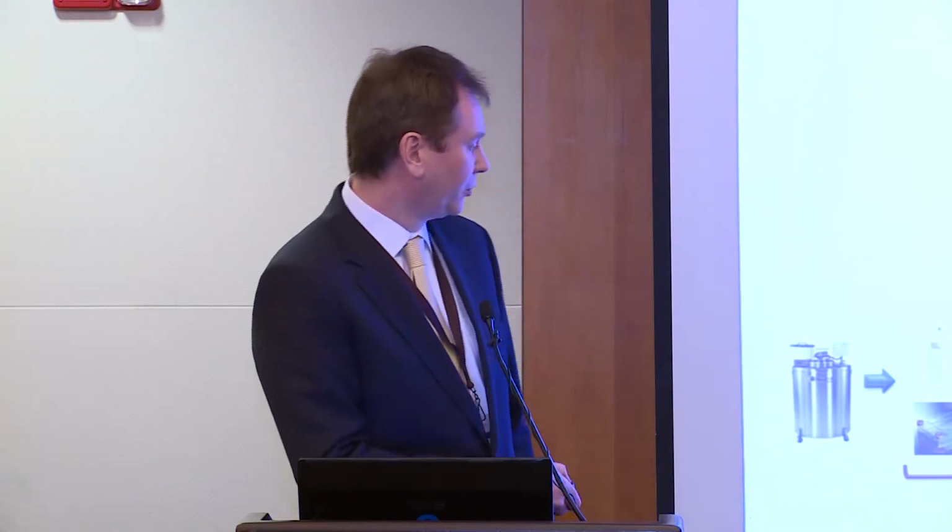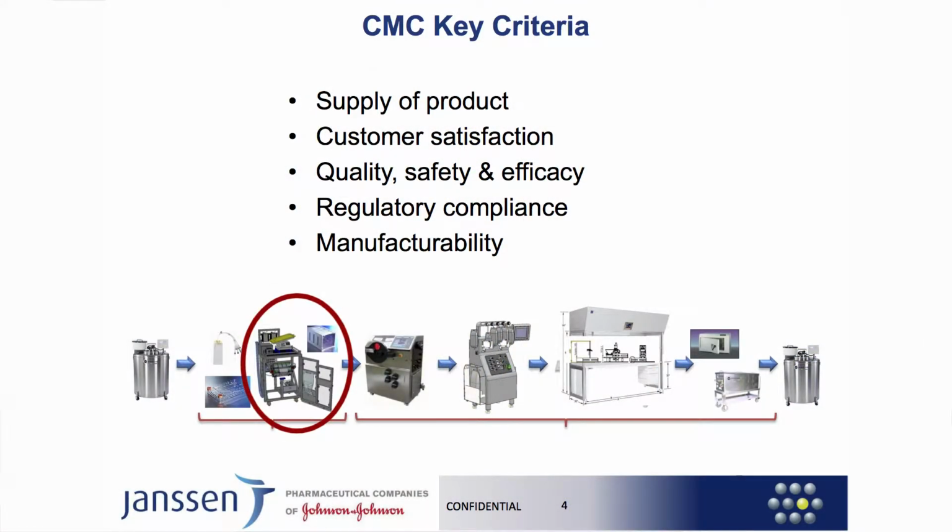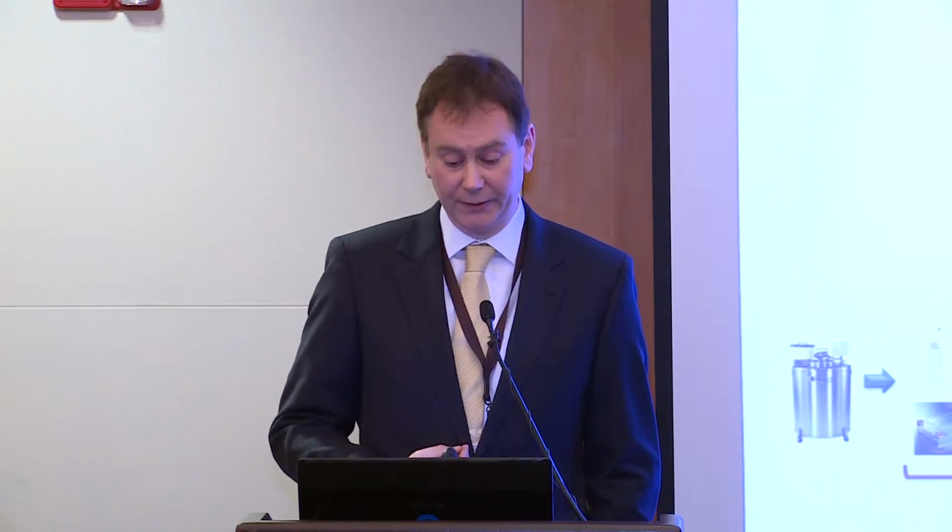One of the key things that we've looked at is the manufacturability, and having the input of experienced GMP operations in the design of the equipment and the processes is very important. So in terms of manufacturability, one of the key things is, can you validate the process? So for example, the manipulation of cell cubes, and the steps in formulation we thought were key to our program, and being able to validate that was essential.